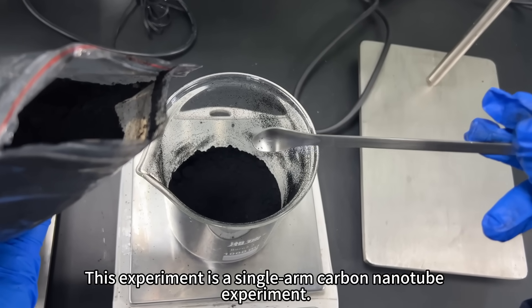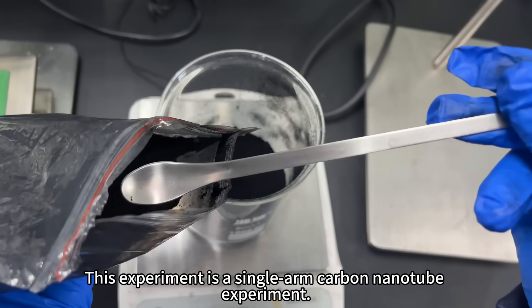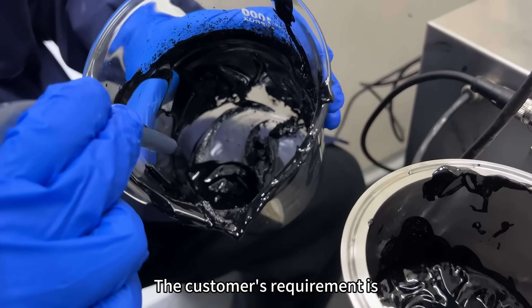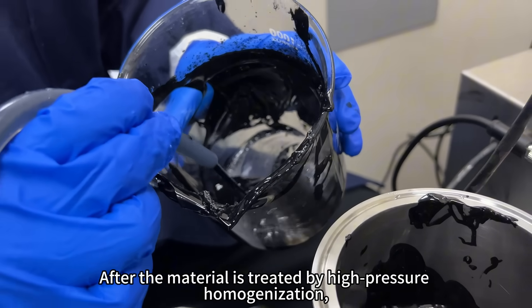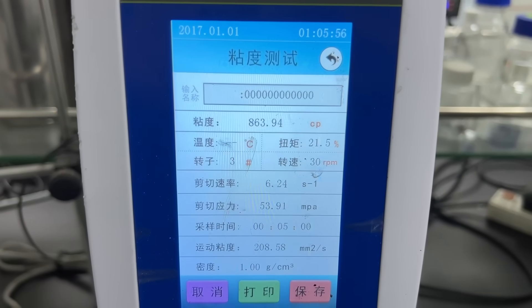This experiment is a single-walled carbon nanotube experiment. The customer's requirement is that after the material is treated by high-pressure homogenization, the viscosity should be less than 2000 cp.